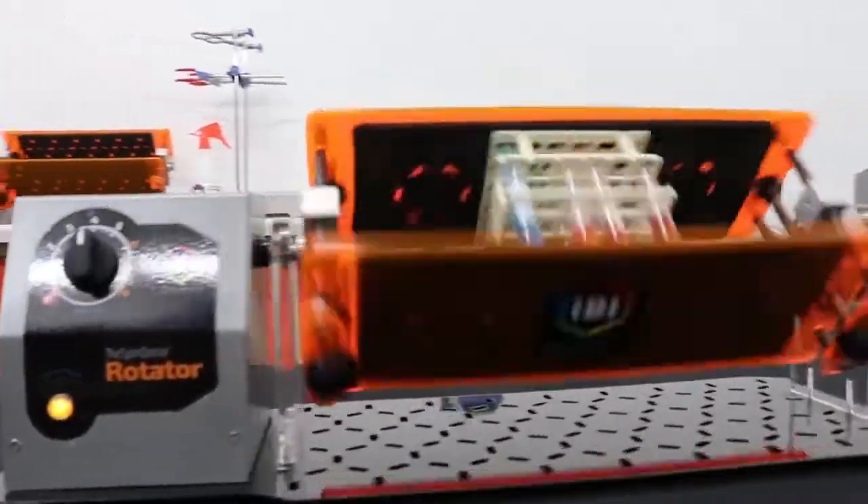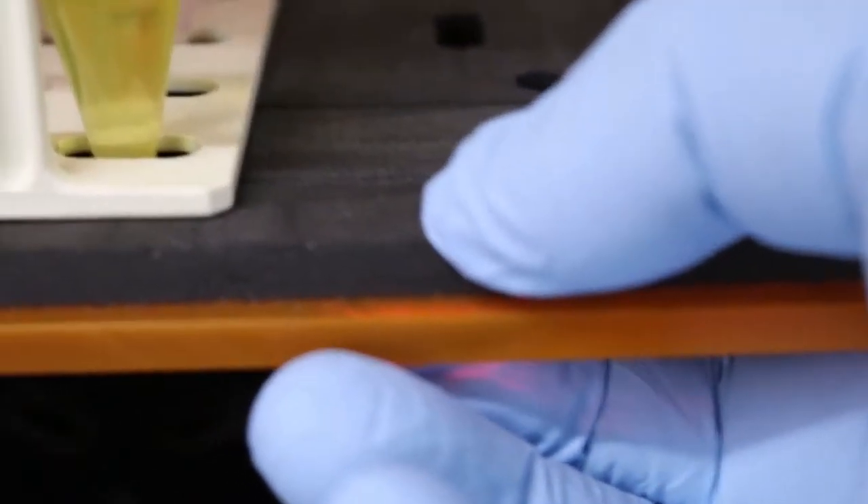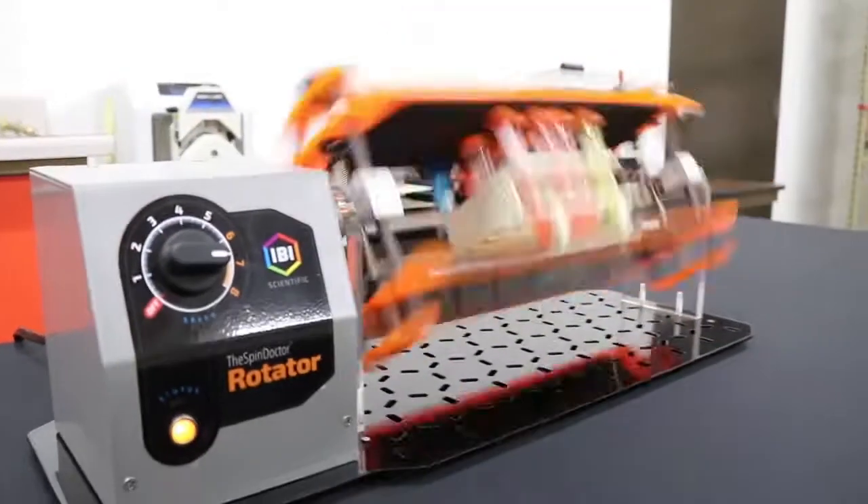The clamping platform will accommodate racks up to 14 inches wide. The Spin Doctor platform is foam lined to gently and securely hold your tube racks in place during the spinning.